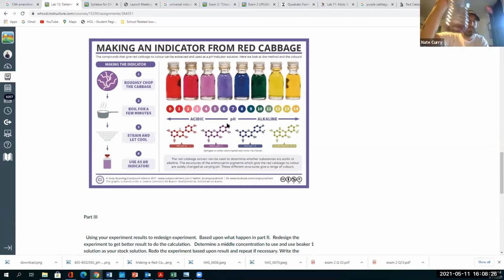It's like purple. It looks really good, actually. So it's about a 4 pH. No, it's a little darker, more like a 5 or 6. But I have dark blood red cabbage to start with. Mine didn't really change much. Mine was a bright orange, and now it's just a dark orange.